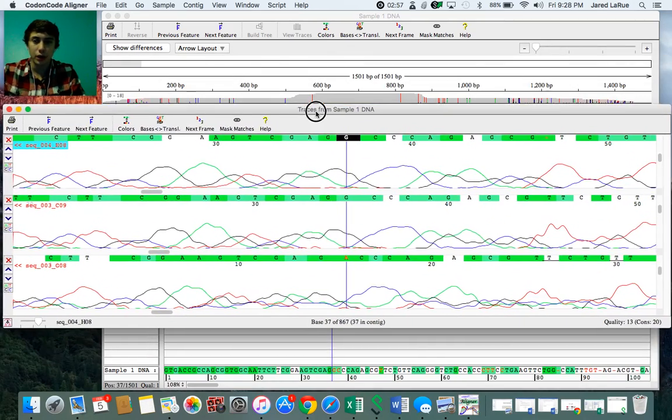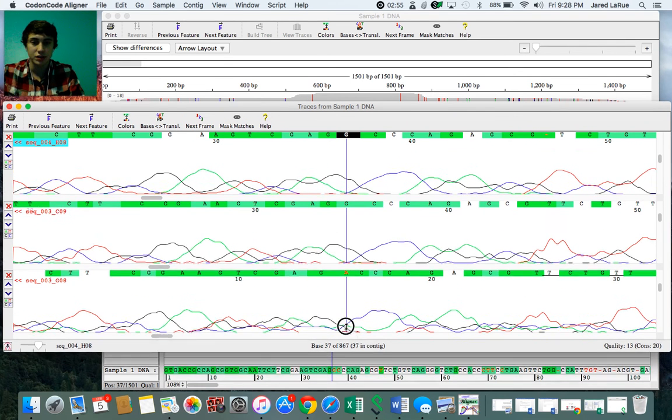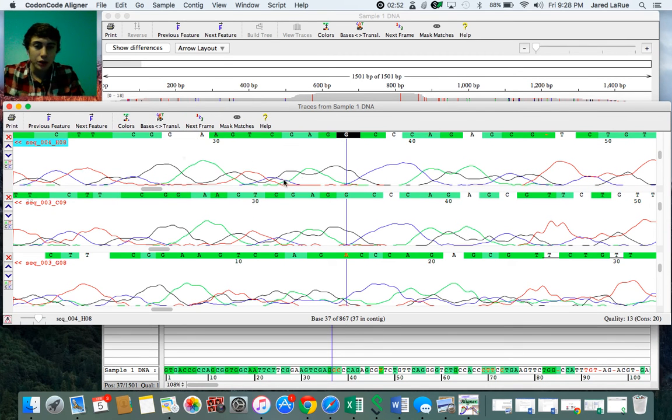It usually only gives you about 3 of your sequences at once, but that's okay. So here's 2 out of the 3 sequences that are correct, and here's one that is different than the other 2. So we come here and we go, what's the issue? So we can see with not major confidence, but some confidence definitely, that these 2 are relatively right, whereas when we come down here, it's pretty junky. Now, none of these sequences are ideal, but you would definitely go with the 3 that we have the most confidence in over this one down here at the very bottom.